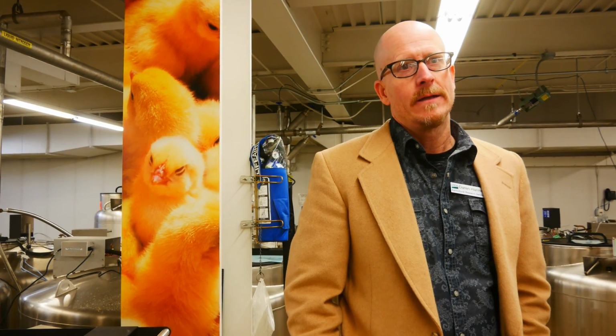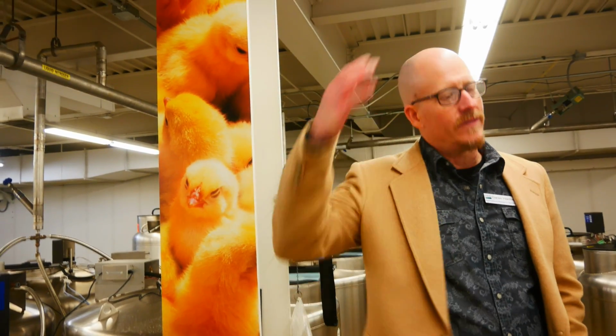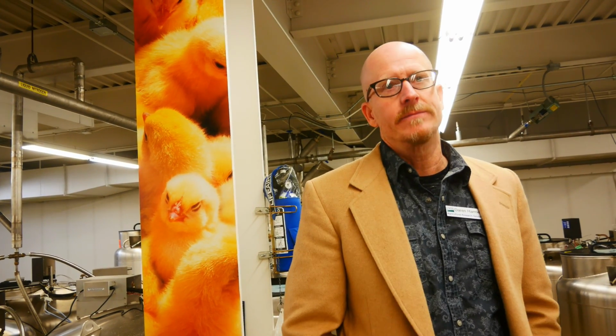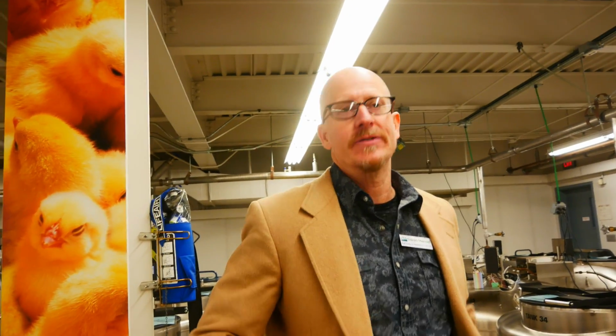So it's not just land plants and land animals. Now you could argue maybe that's outside of our mission a bit, but it's the right thing to do from a humanitarian standpoint. Interesting. We help with some zebrafish. The National Institute of Health uses zebrafish for some of its models. Okay. So we have zebrafish germplasm here, and again, we can reconstitute a zebrafish line from those. Yes, it's eggs and semen, just like other species, if they need us to.